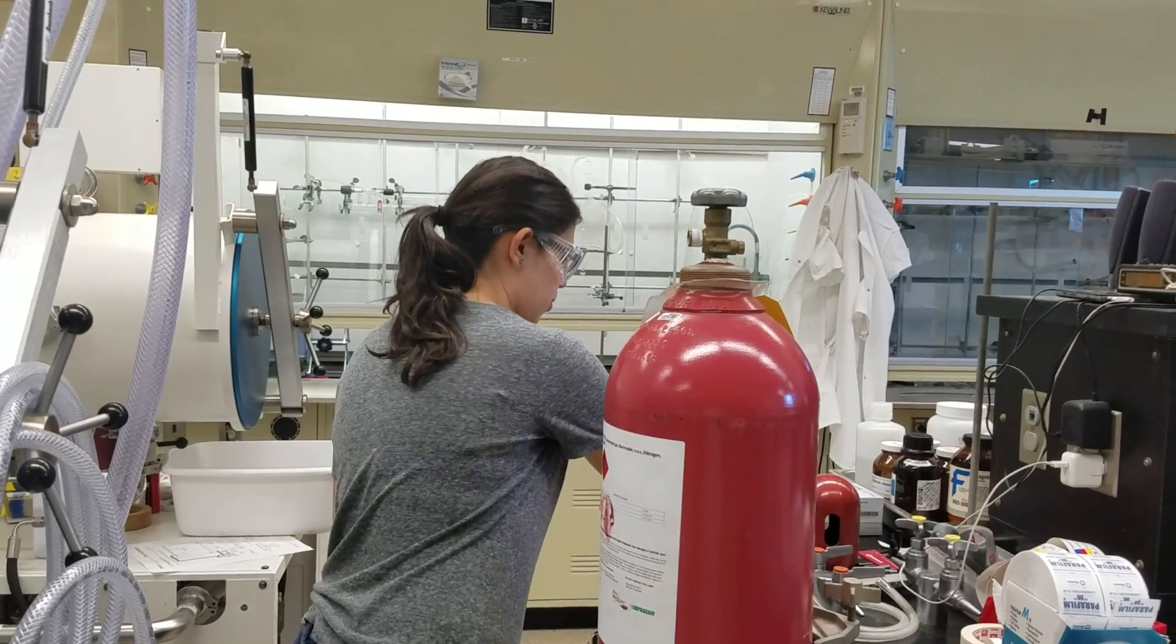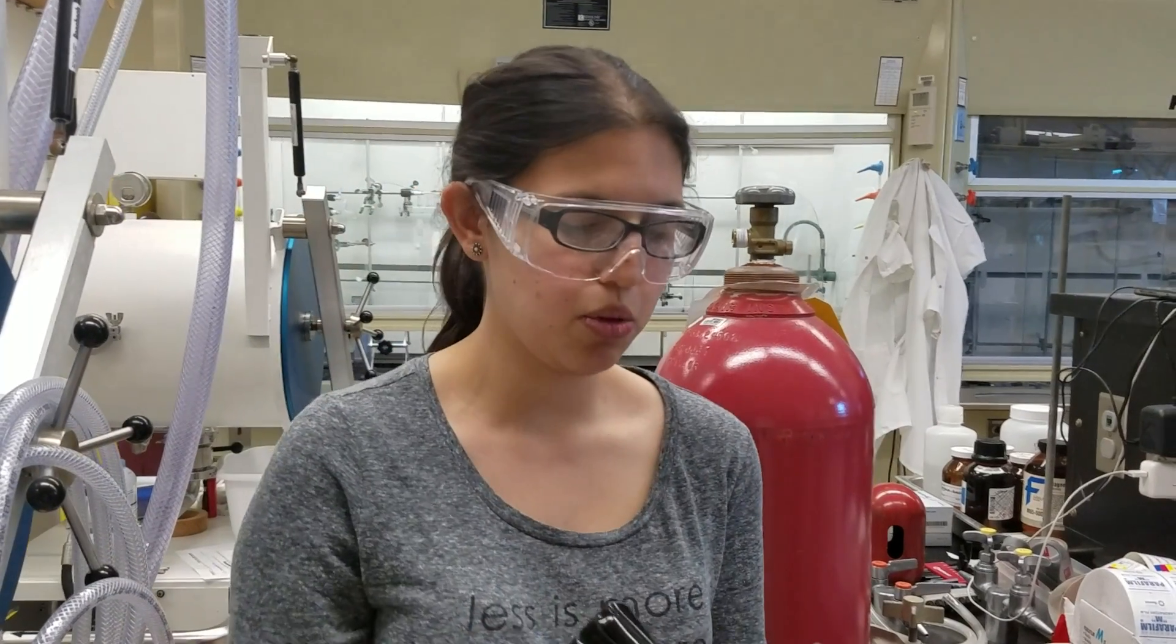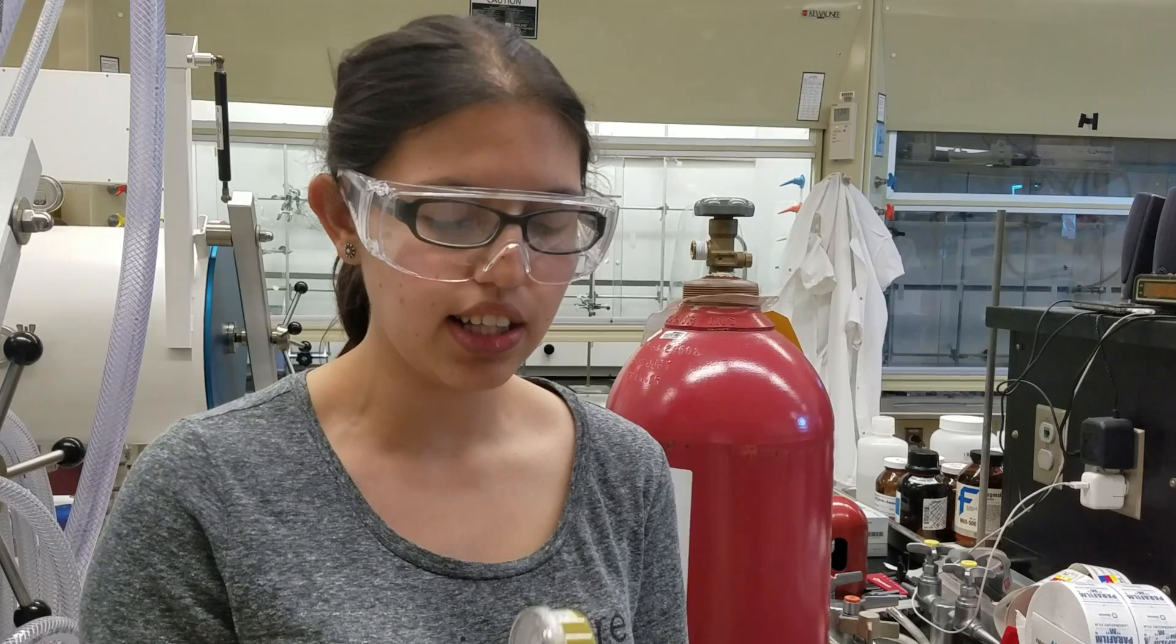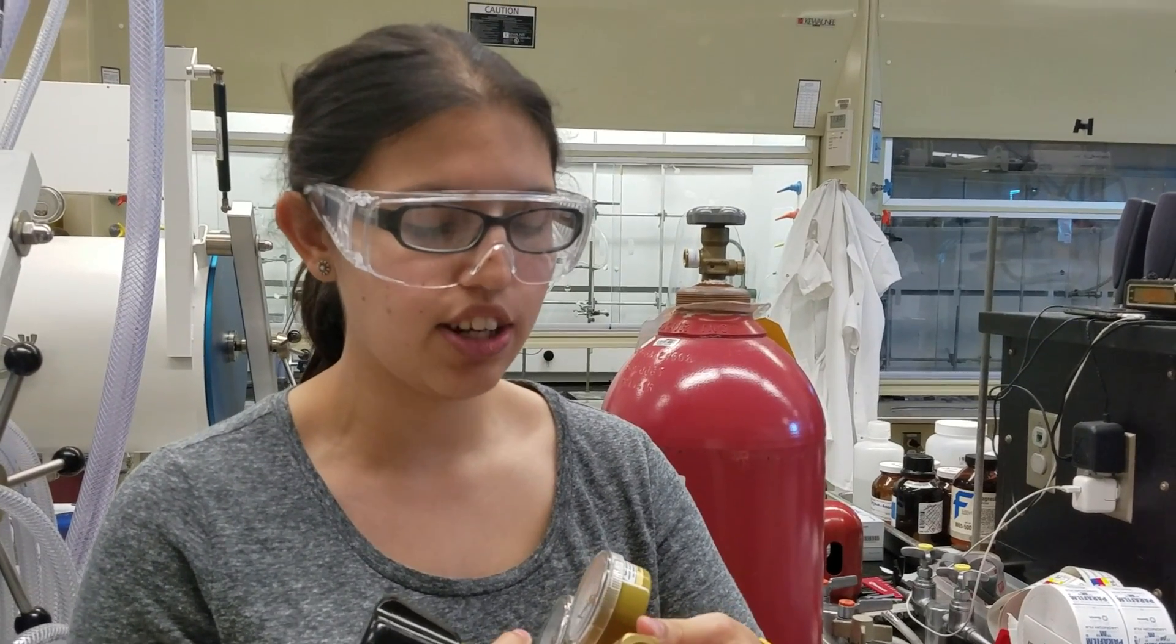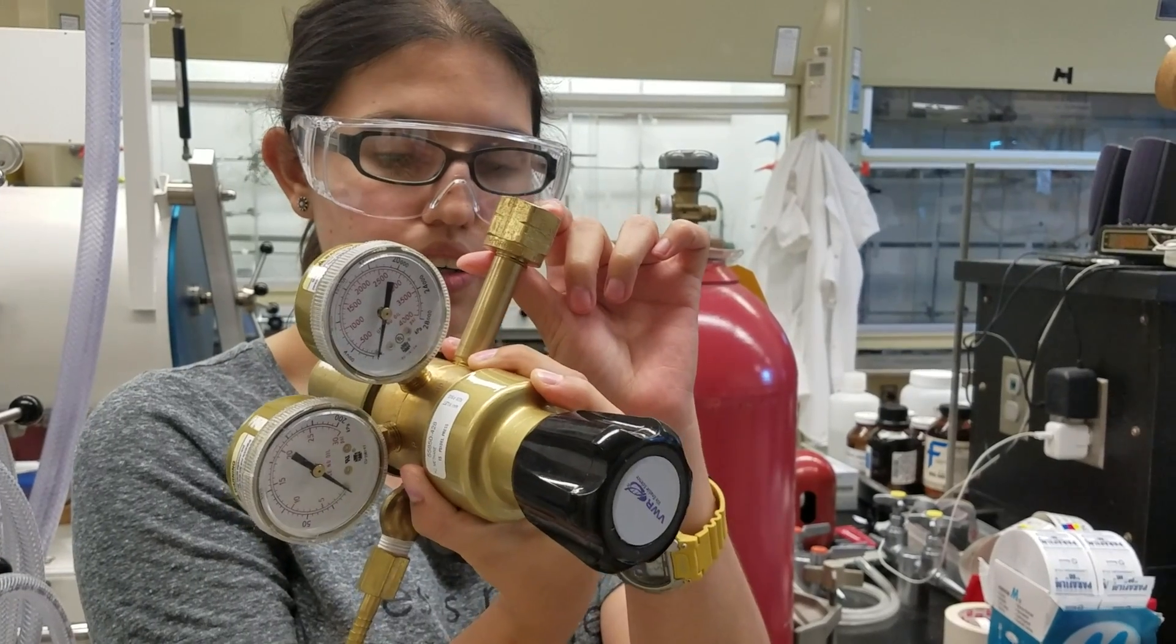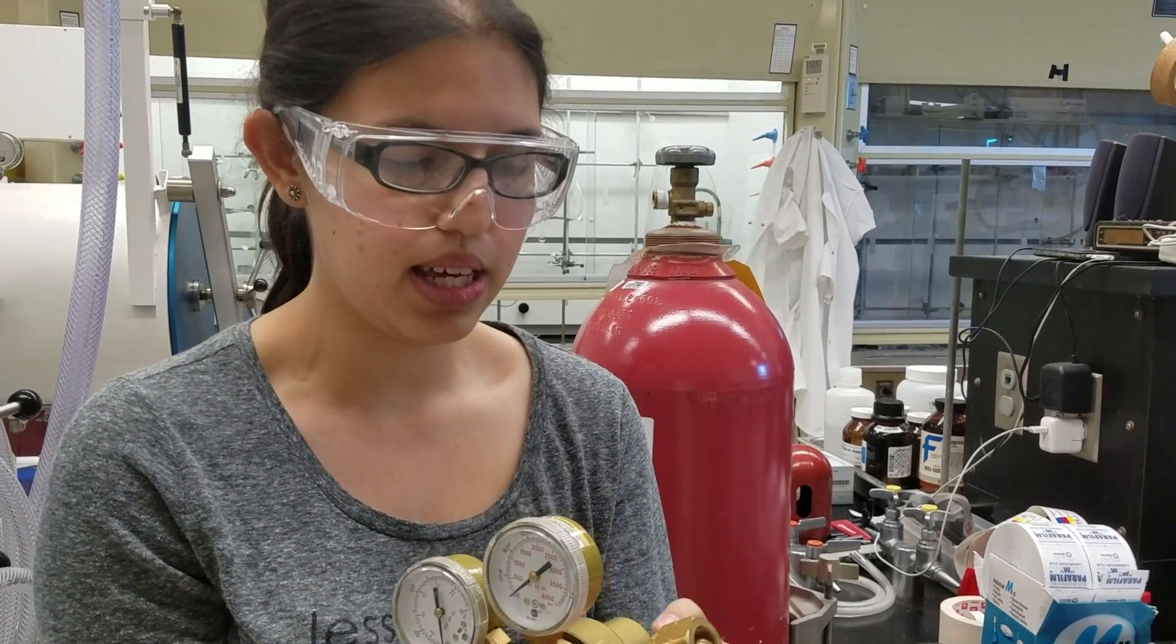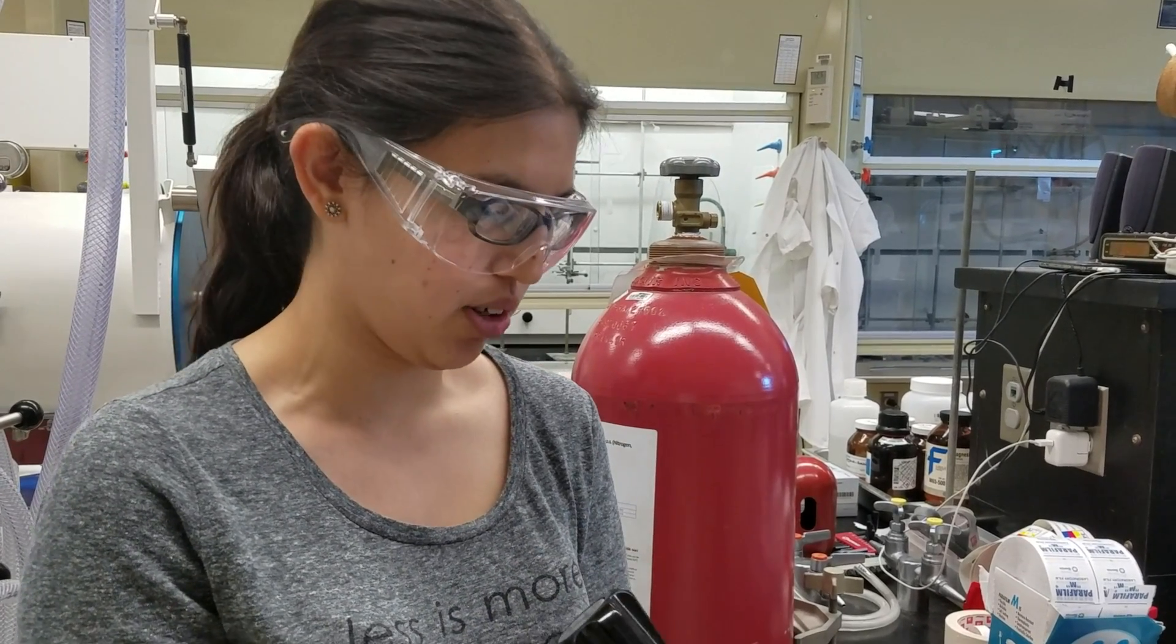So the third thing we have to do is get this regulator. In this case, because we're using a mixture of hydrogen and nitrogen gases, we have to use a hydrogen regulator. And you can make sure that it's the hydrogen regulator by looking at the nut on the regulator. And it should say hydrogen. It should be CGA 350. If it's anything but that, don't use it. It's dangerous.